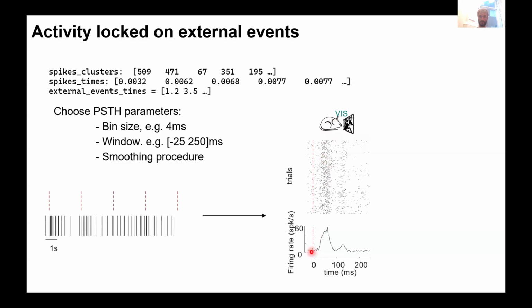And then you can take the average of that, and it's going to look like this. So you have a nice response here with a little second bump, and that's for one neuron, and that's basically the PSTH. There are a few parameters you can change to smooth this a bit. So let's say we take this matrix and we smooth it with some Gaussian filter. In that case, the Gaussian filter was 1 bin, so basically no smoothing. But you can increase it, so 5 bins, 15 bins, 30 bins, and it depends a bit on what you want to see. But be mindful that the bigger the filter, the smoother it will be, obviously.